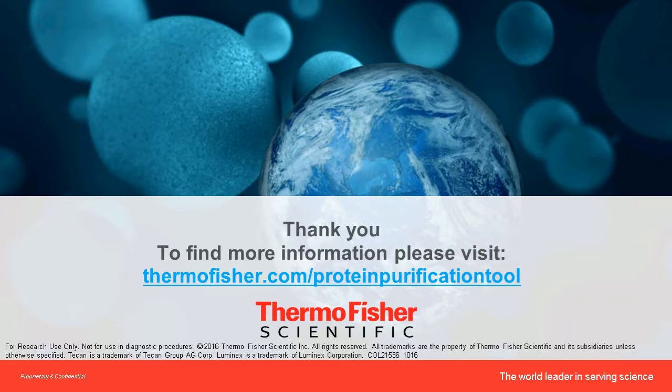Yes, I'll take that. So we see that a typical core facility today processes about half of the samples that they obtain being IP-MS samples. So the method is actually pretty popular today, and I think with the introduction of more specific enrichment antibodies, we're going to see an increase in this method, particularly when it comes to detection by mass spectrometers.